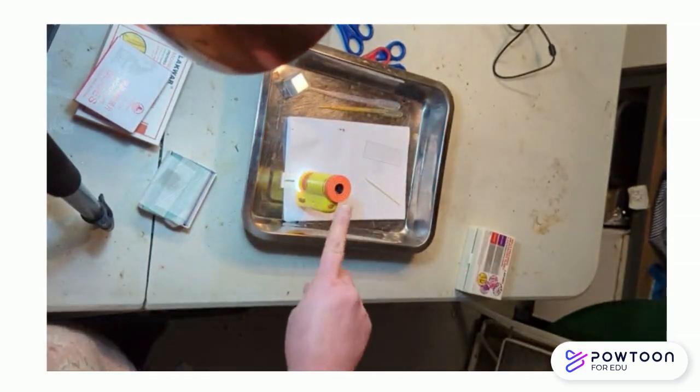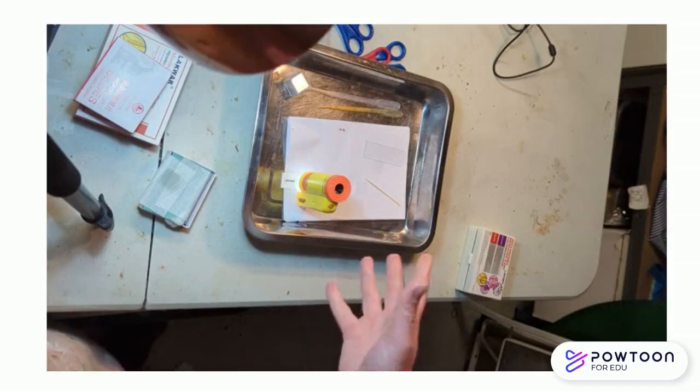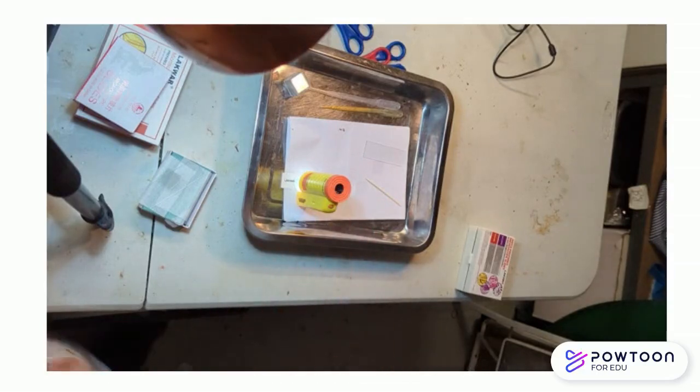But do not assume that your students will just find the right focus and the right magnification the moment they bend down. Be prepared to help them, whether they're juniors or seniors. Obviously, do more for the juniors.